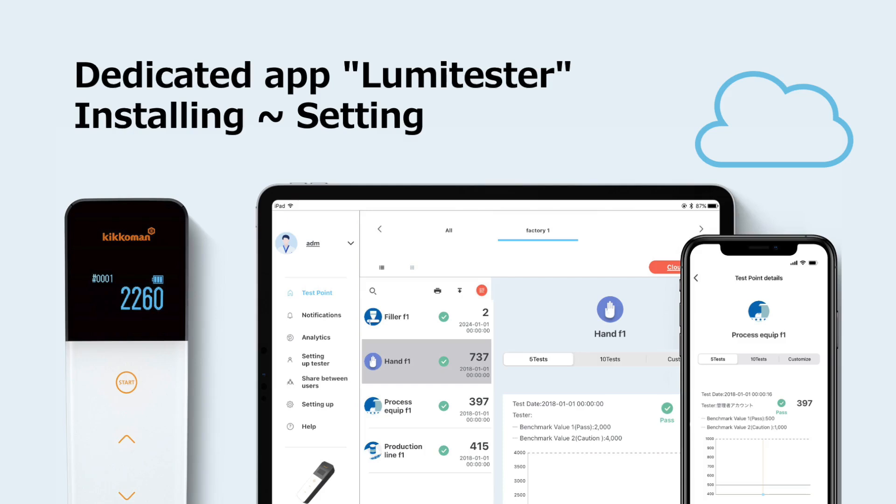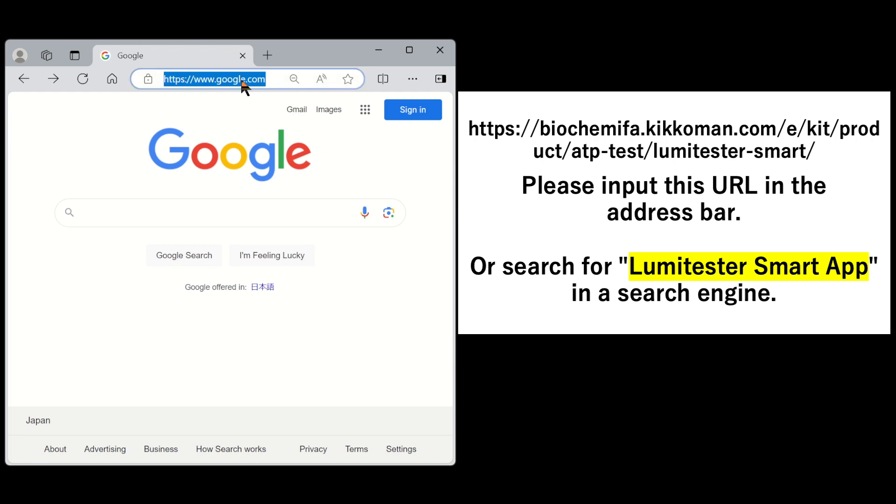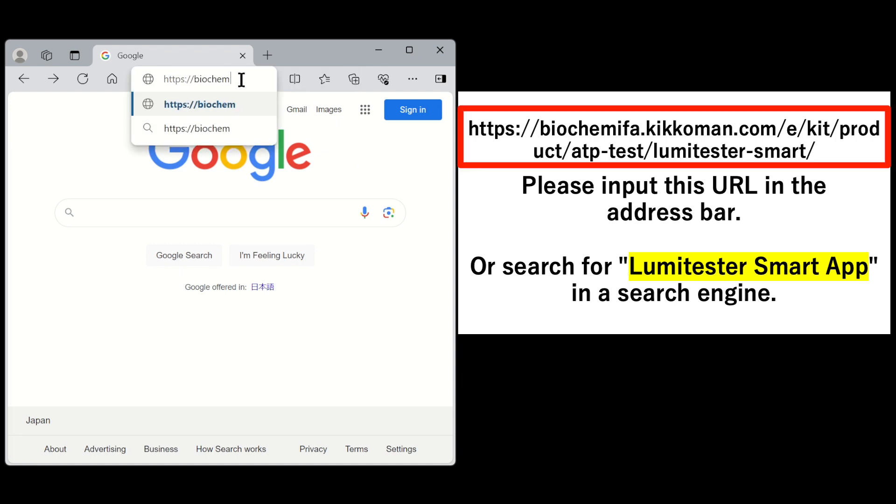In this video, we will explain how to install and set up the app Lumetester. At first, we will explain the process from downloading the app to registering an account. The app Lumetester can be downloaded from our website. You can input this URL in your address bar or search for Lumetester smart app in a search engine.